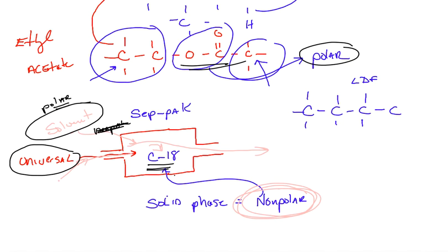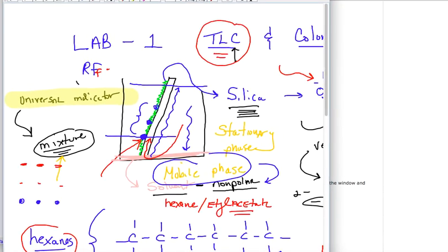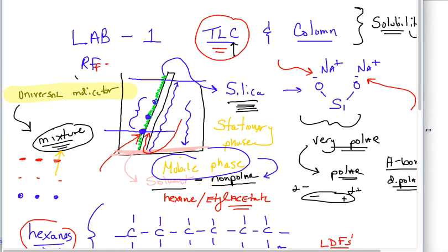Stay with the solid phase, in this case, which is nonpolar. It's flipped on its head. TLC is different. Or go with the more polar solvent. And the chemicals that come out first preferred the mobile phase or had similar attractive forces. The ones that came out last in your test tubes preferred the solid phase. So both of these tests should confirm, but don't forget column chromatography is going to be different than your TLC.